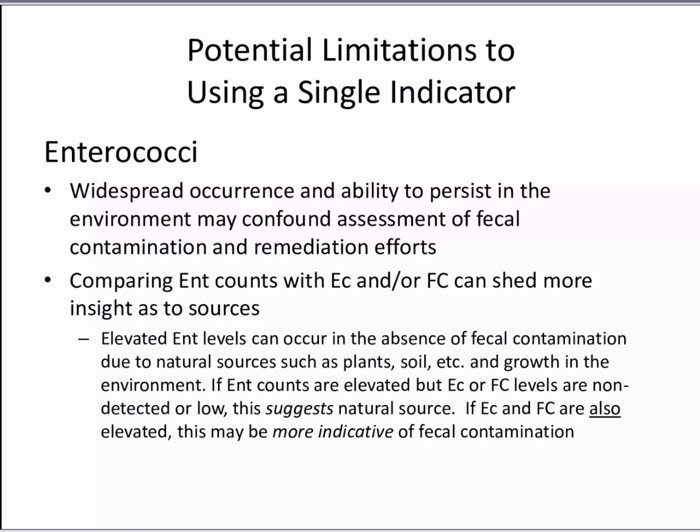If you've got fecal coliform or E. coli results, you can get more information by comparing those results with the Enterococci counts. And that's because elevated Enterococci levels can occur in the absence of fecal contamination due to natural sources such as plants and soil, etc.